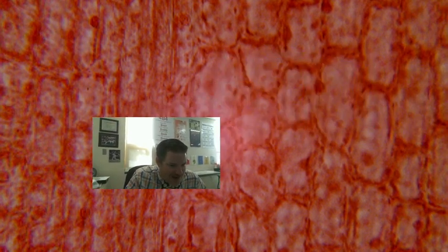There's the nucleus. But you can also see there are some tinier dots kind of on the outside of them, especially on the ones over here. They're all around. If you look all around, it kind of looks like freckles almost. Those are going to be chloroplasts inside of these cells, because that would be the second largest thing that you'd be able to see in this particular cell.